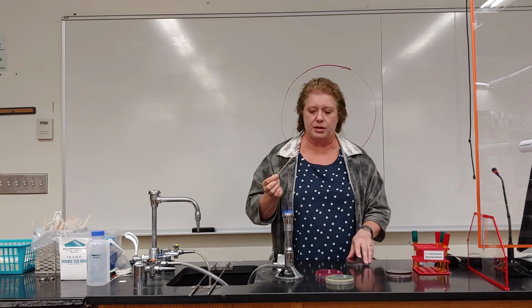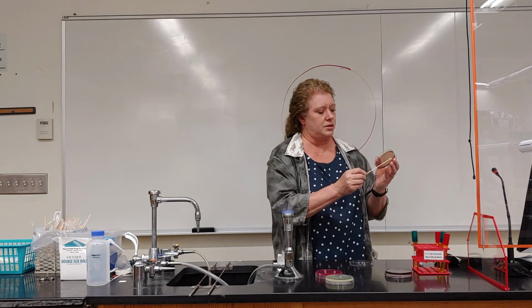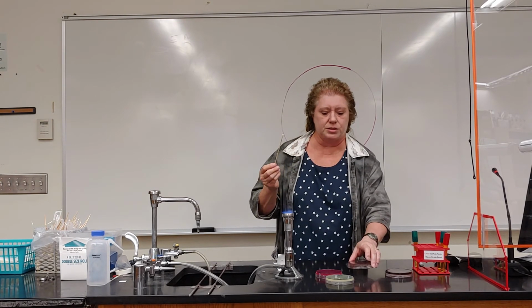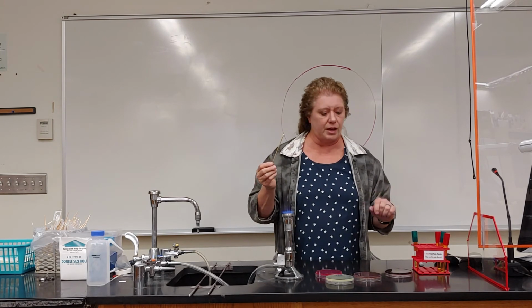Pick up your Conky plate. Look at and gently swipe it across the surface of the MacConkey plate. We're done with that one.